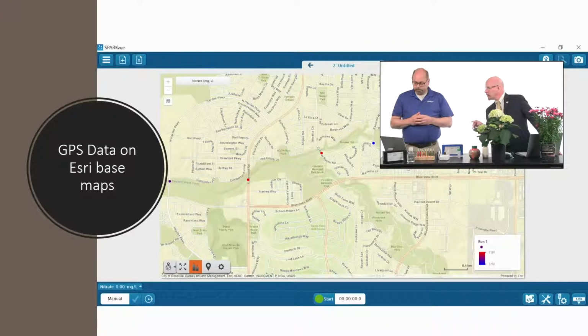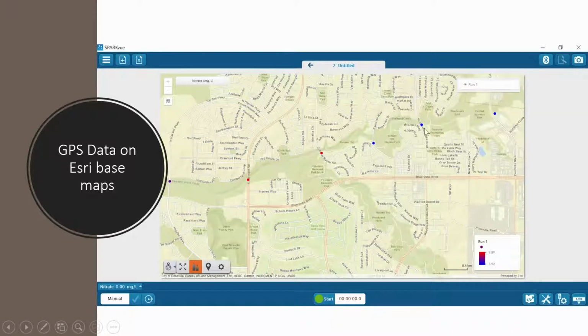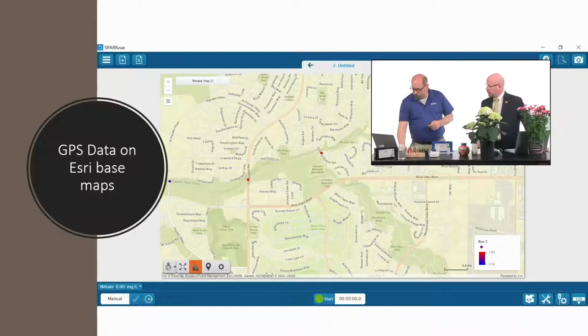That's interesting. So I'm looking at the map. With your pointer, point out where those dots are. Where's the stream? Where are the different points that you measured? So this very first one is where PASCO is, and the stream sort of runs this way. I just went to places where I knew the roads crossed, so those dots are blue and low, but then it turns red at higher concentration. So we are actually capturing some nitrate infusion, maybe some runoff from fertilizer possibly coming in.